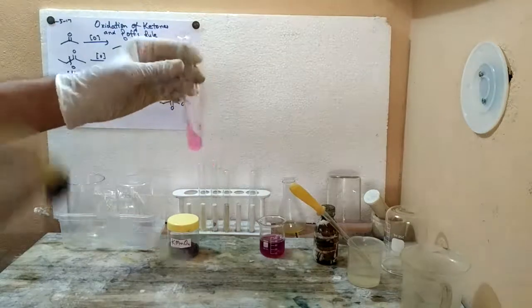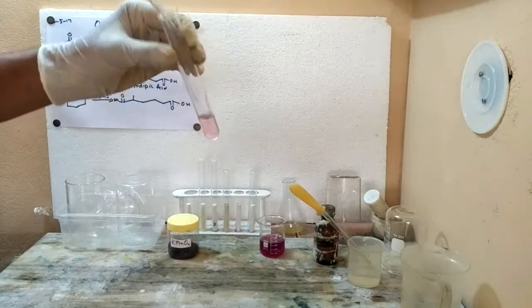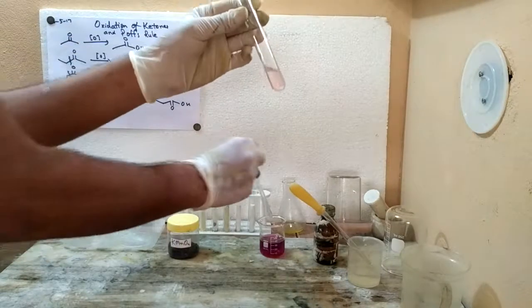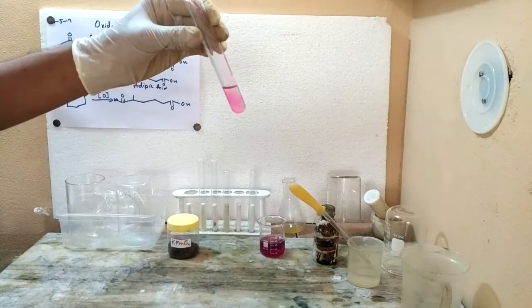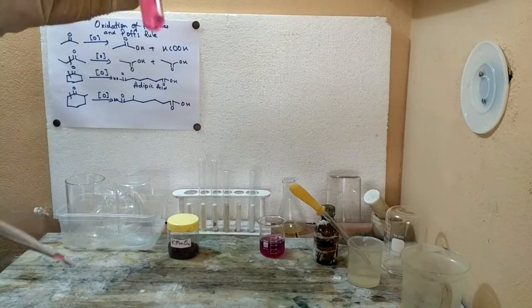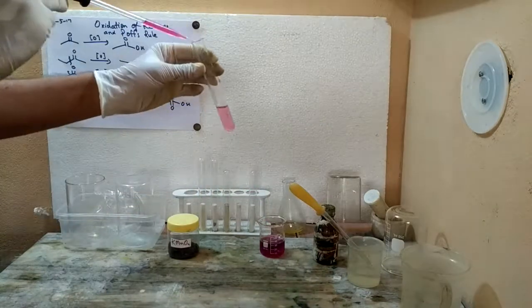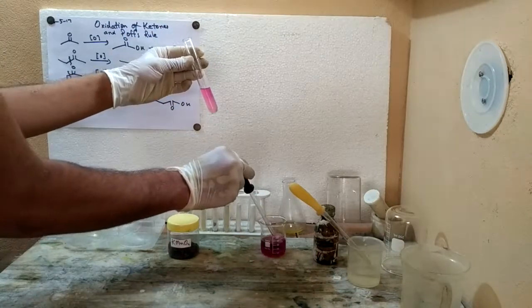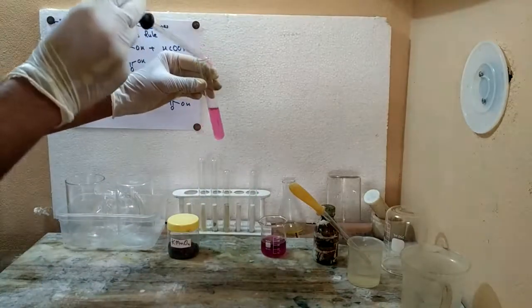To some extent the reaction proceeds, because the addition of sulfuric acid to water, which was present in the acetone, produced a large amount of heat, which was enough to carry out the oxidation. Yeah, I feel this is enough.